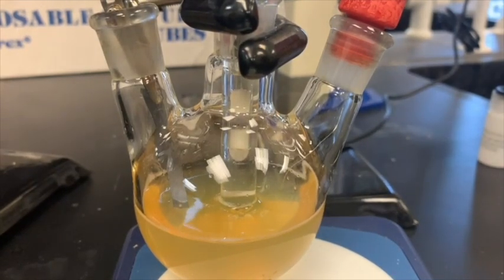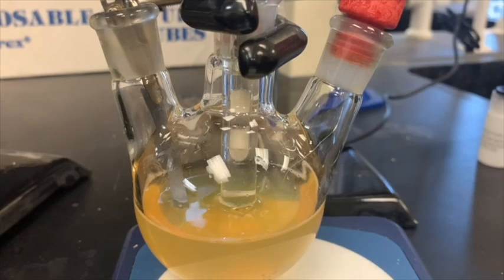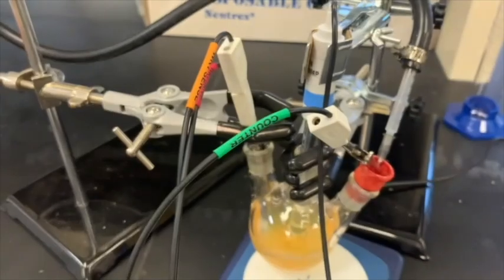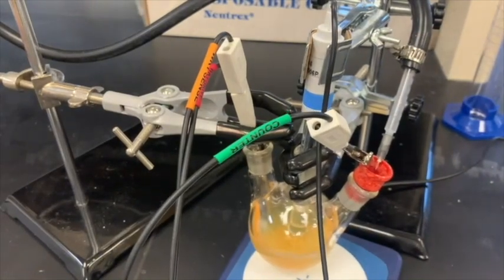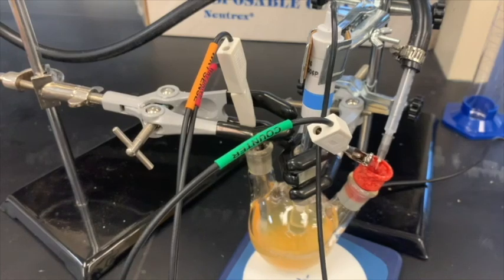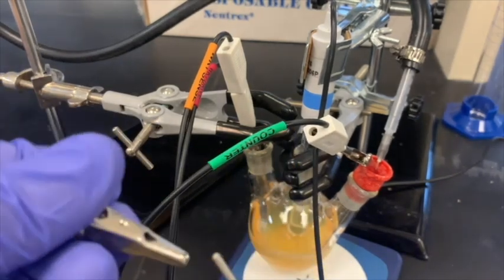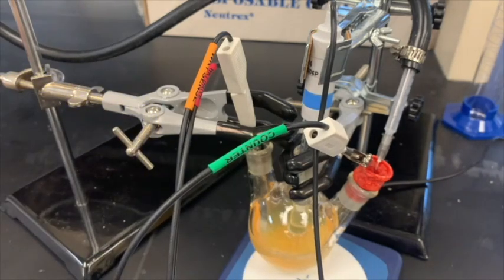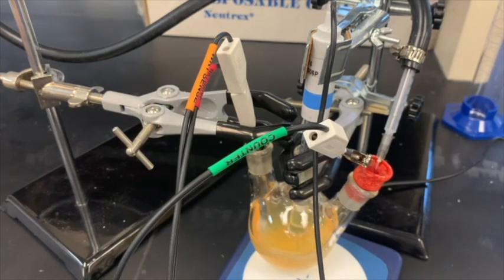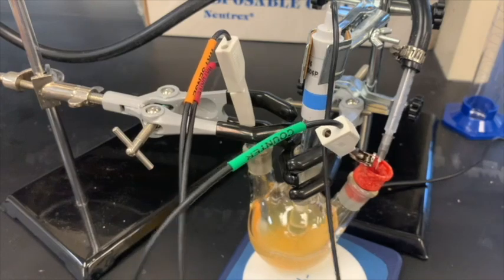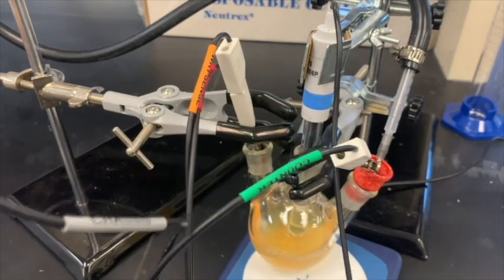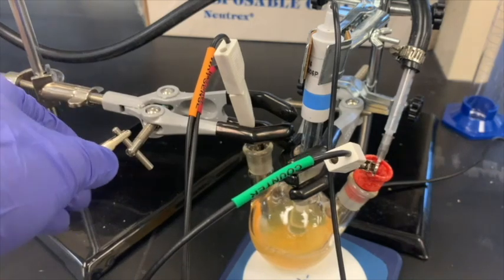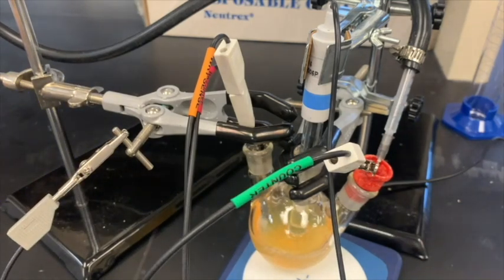Next, we should add our potentiostat clamps to the electrodes, which are now in place. The work one and work sense goes to the graphite electrode, while the counter electrode goes to our platinum wire. Finally, our reference electrode will go to the silver-silver chloride electrode in the middle neck of the flask. The last clamp is the gray chassis electrode clamp, and this can go to any piece of metal that is on the lab bench. In this case, it goes to one of the screws tightening the clamps.